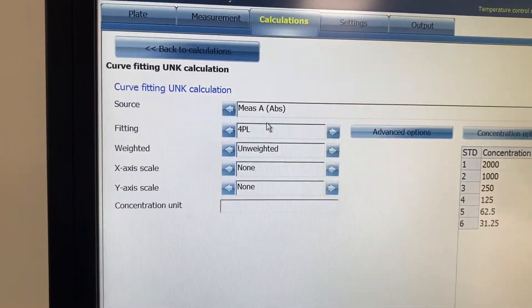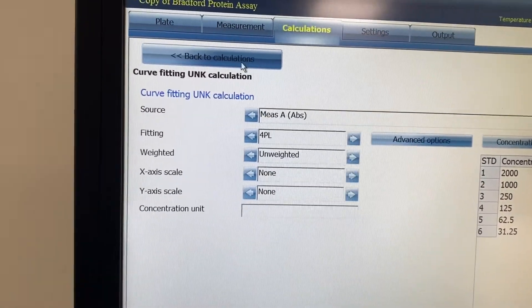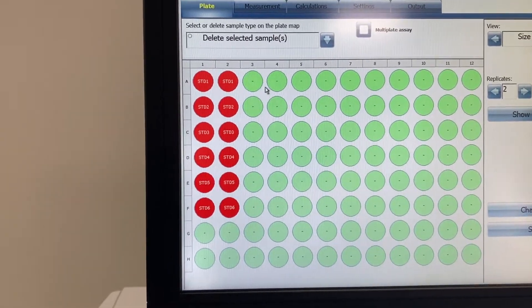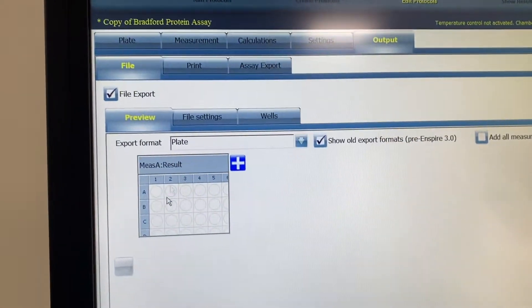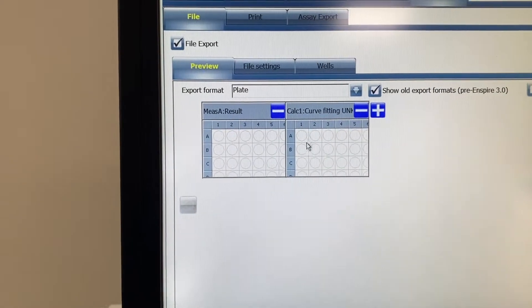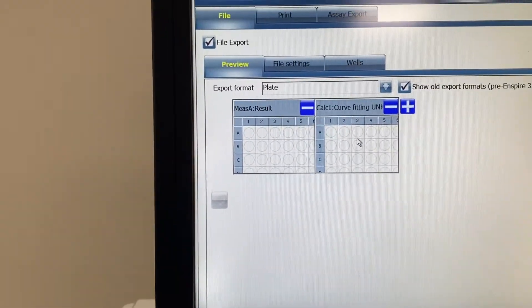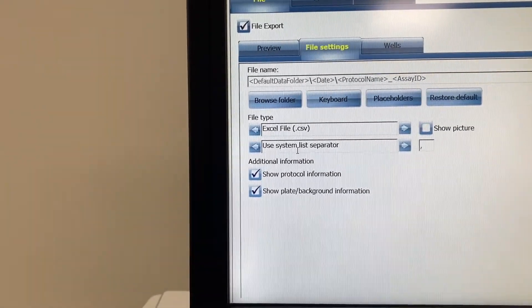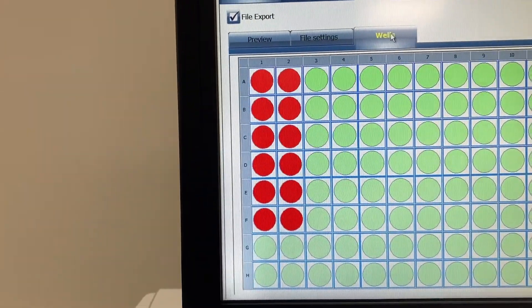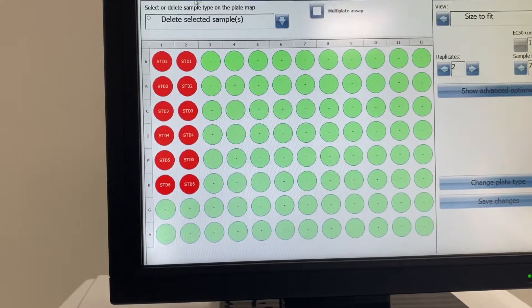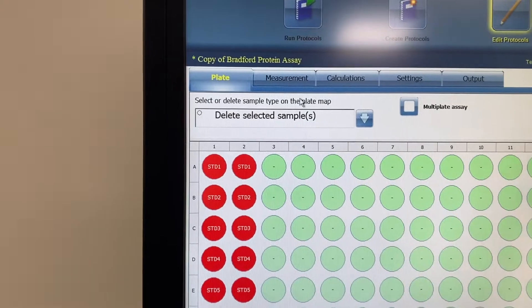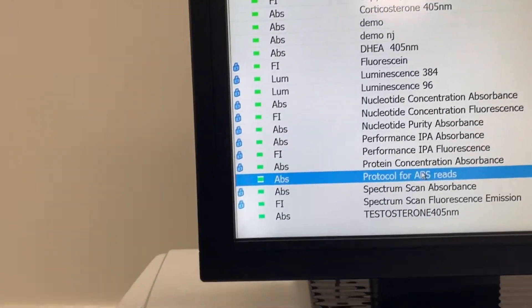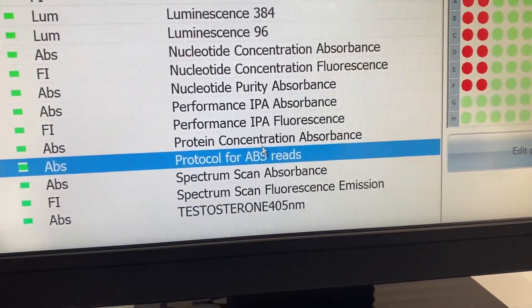The curve fitting types available include linear regression, spline, and 4PL. I typically use 4PL, but it depends on the type of response your readout is producing. Say we're going for a 4PL fit. Now that we've set up the standard curve, told it the concentrations, and specified the fit, when we go to output we also have to tell it we want the calculated concentration — if you don't add it here it won't show. Add it, and you'll be able to look at your file settings, for example CSV. Now you've set up your customized protocol — don't forget we changed the name — so click elsewhere, save changes, and the protocol is created and fitted for the assay you're actually doing.